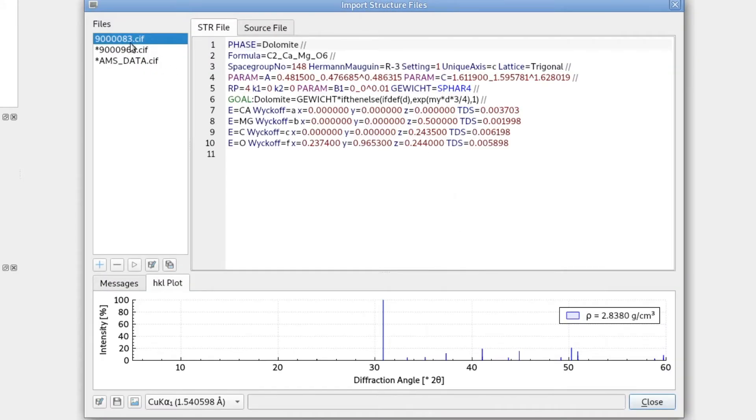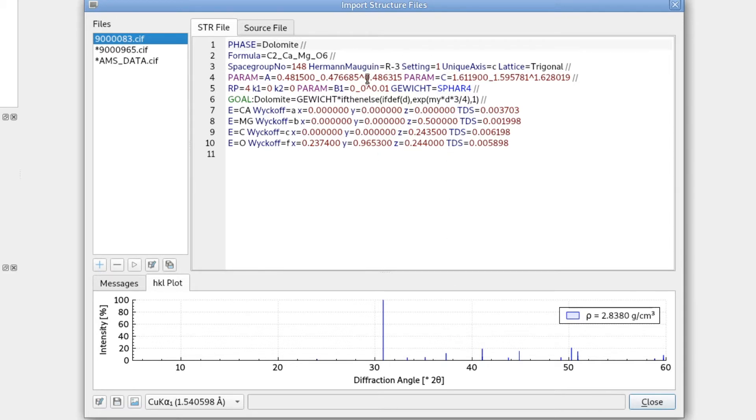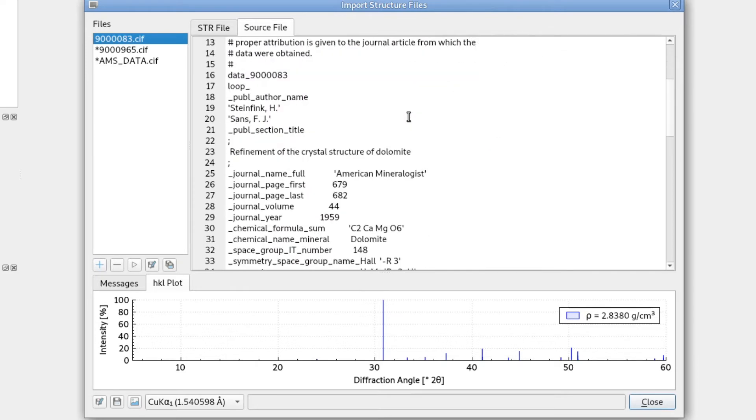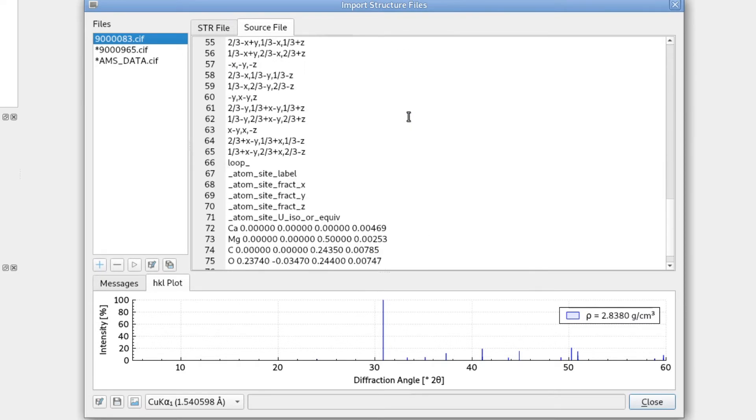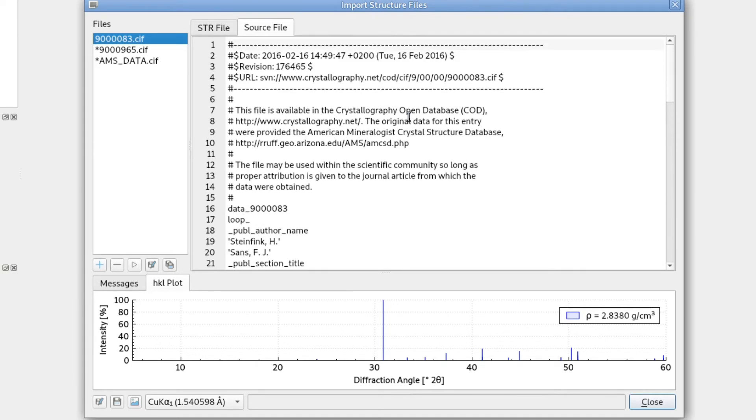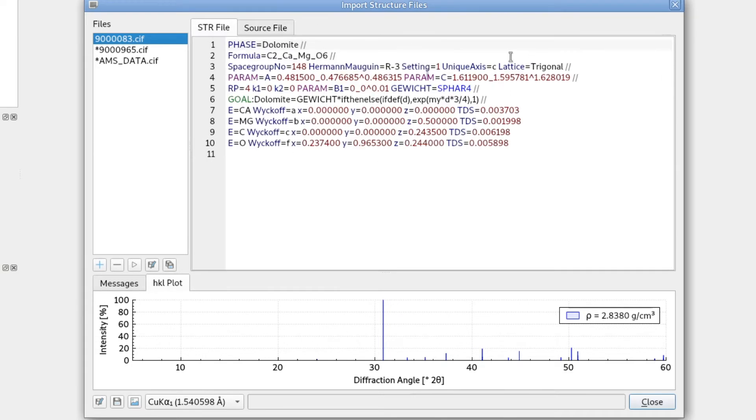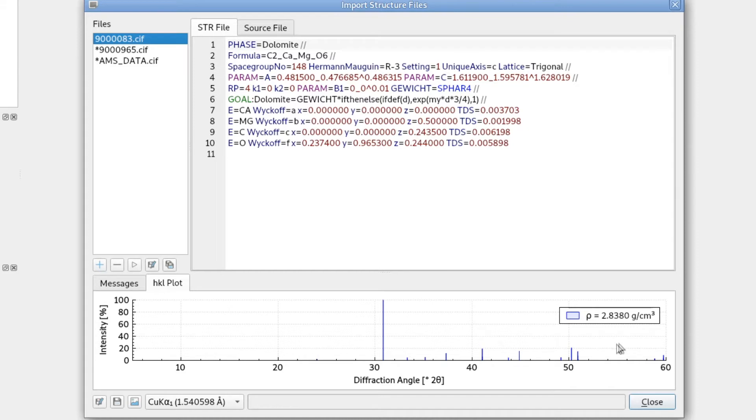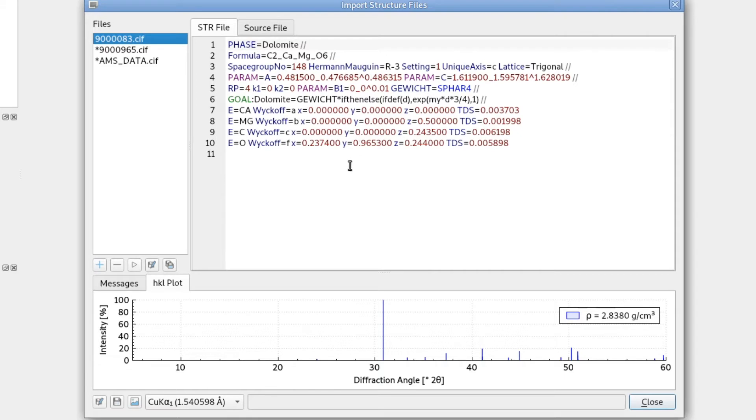So the first one was dolomite. It was automatically verified, which means that it was converted to the BGMN structure file format from the source file. We can still view the source file, the CIF in CIF format here - that's exactly what we downloaded. And this is the converted file. Then it ran a verification, so it ran BGMN in the background to calculate the line positions. If we see the line positions and also the calculated density, verification was successful. So this file was converted to BGMN structure file format automatically.